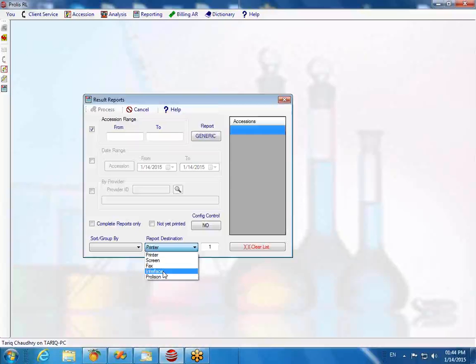The system is providing reports to all those EMRs according to their account settings. We have to make sure that the report only goes to the correct target. All those kinds of things are taken care of through our bridge, and that's another huge system, which I'm not going to talk about in this sitting. If the time comes, we are going to provide you that bridge also, and set up the system the way it should handle all the reports automatically. These reports automatically go to the EMR. You don't have to send them. You don't have to push them. Oh, really? Okay.